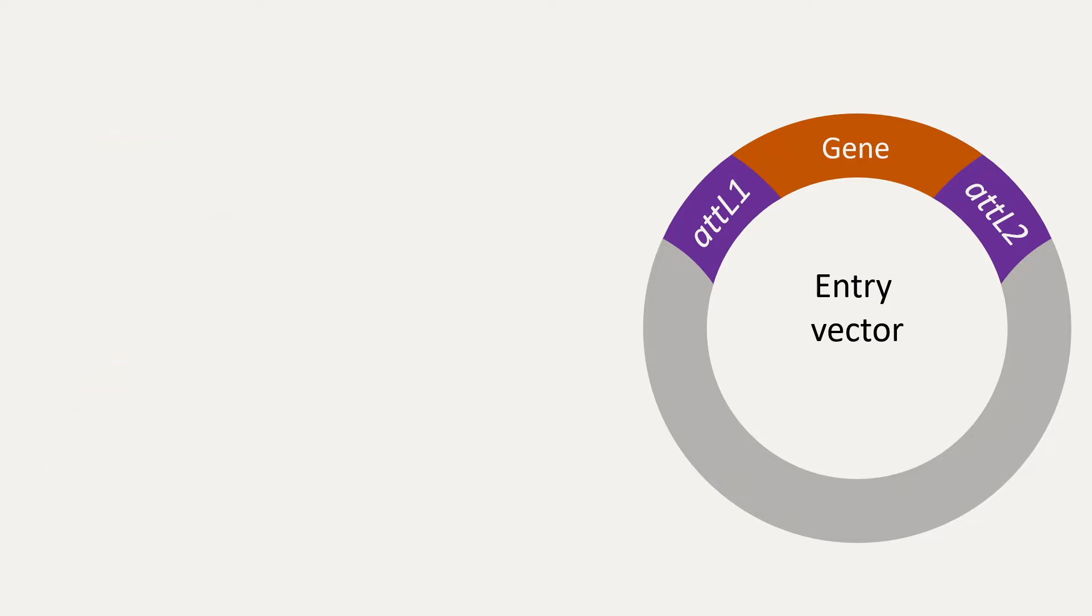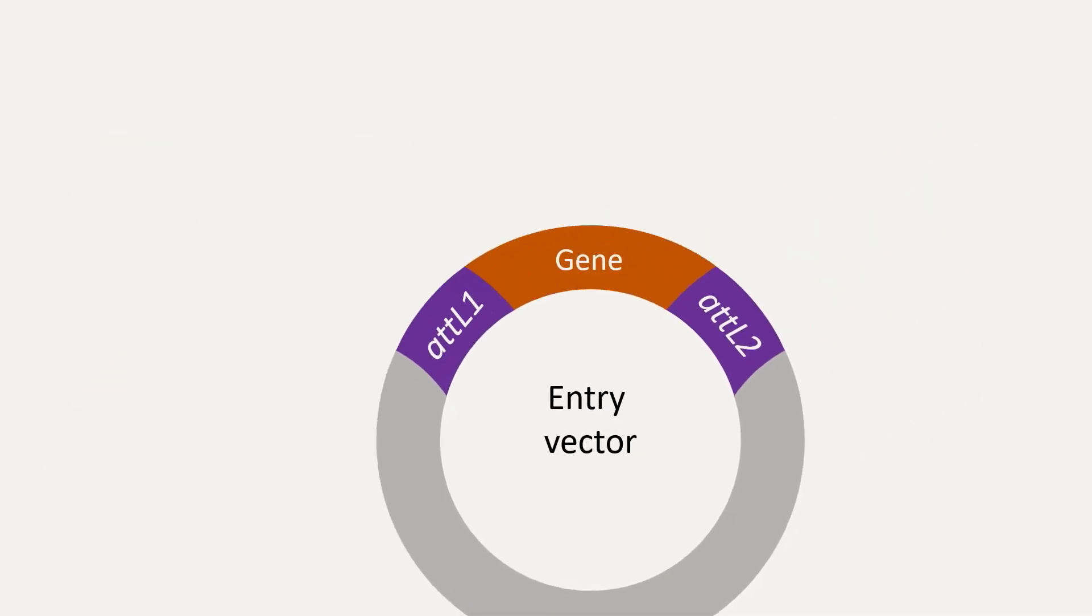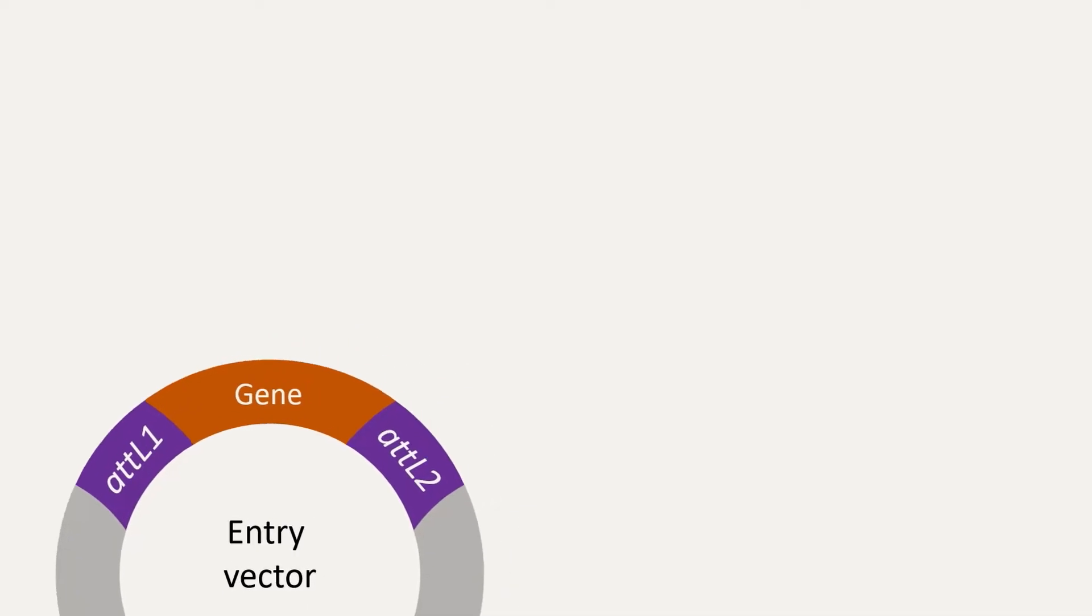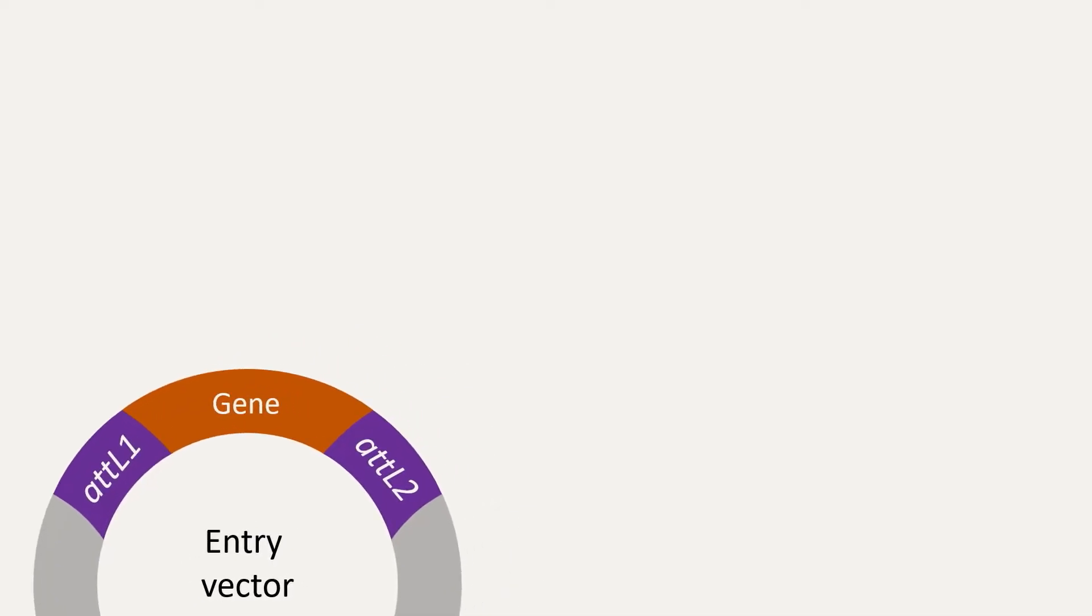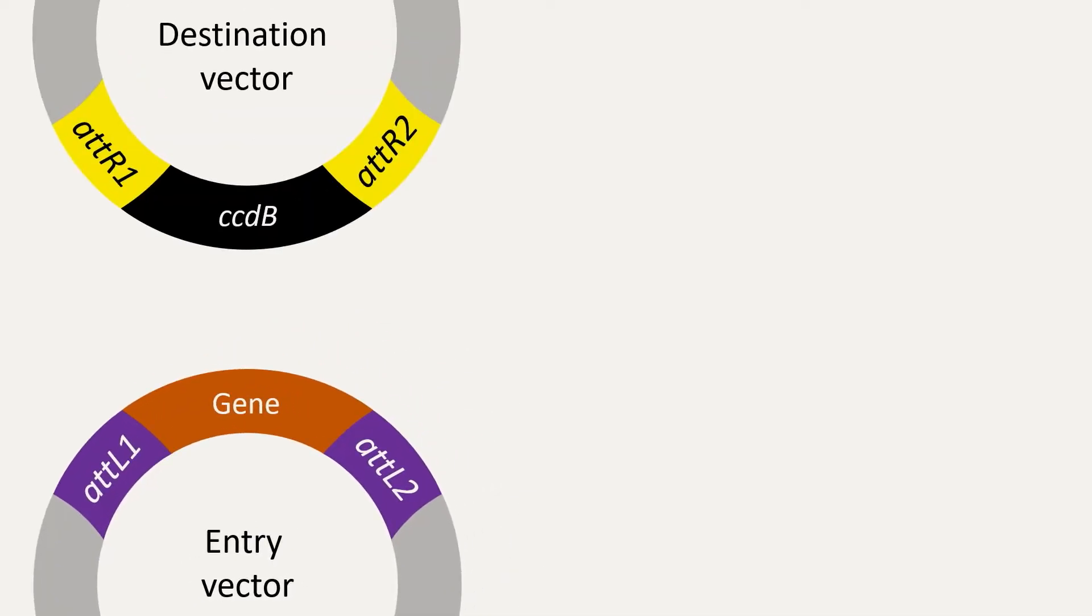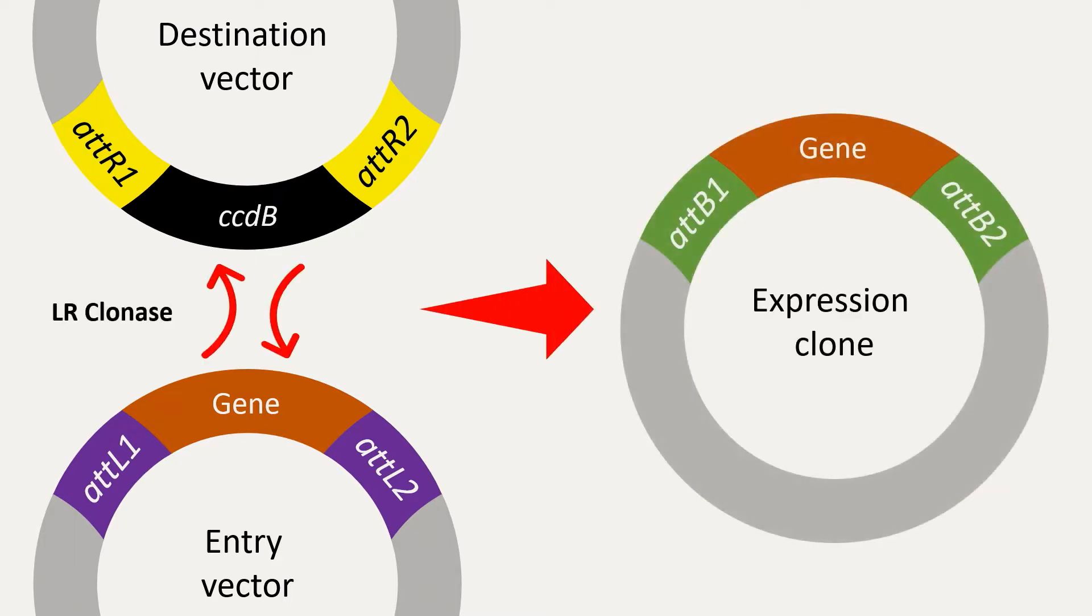In step 2, the LR reaction, the newly created entry vector is mixed with a destination vector containing attR sites and the LR clonase mix. The resulting reaction creates the final expression clone, with the insert flanked by attB sites. This clone is then ready for transformation and expression in a host organism.